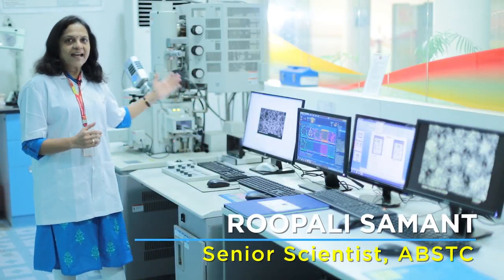This is a microscopy lab and this is a scanning electron microscope. The scanning electron microscope reveals a very beautiful world of nanostructures.